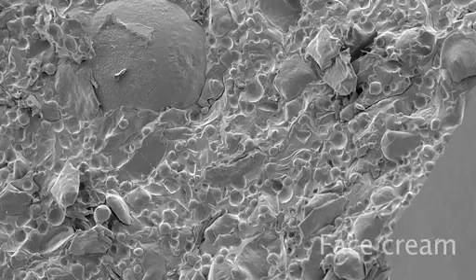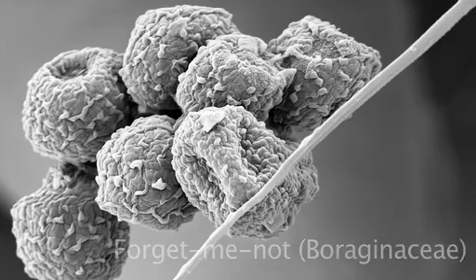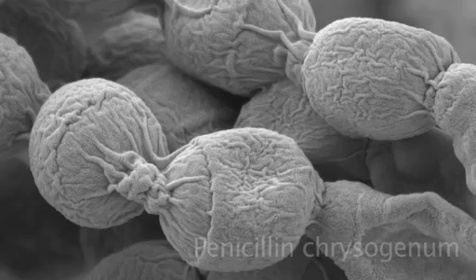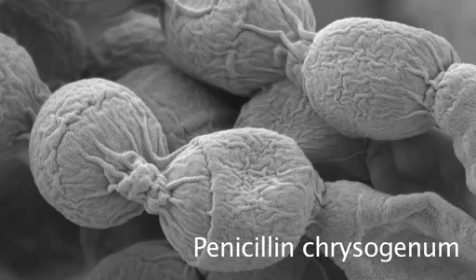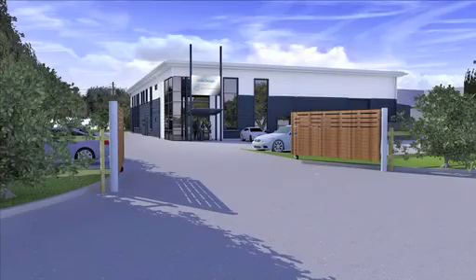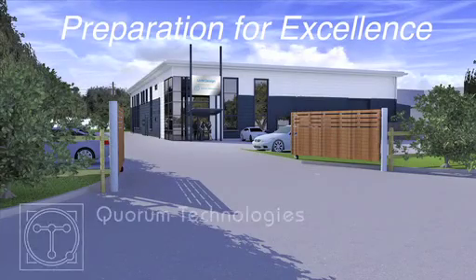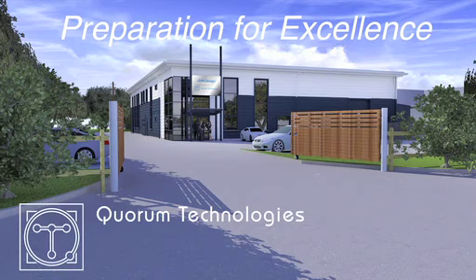Want to find out more about cryo-SEM? Then Quorum run regular demonstrations and introductory workshops, and would be delighted to show you the capabilities of the 3010.